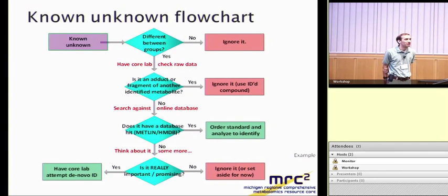There is work in the field attempting to collect the data all together into some sort of more cohesive strategy, to say all of these things fall under this umbrella, and here are all of the peaks that we have from that. Generally, the quantitation is very comparable across all of the things. You're not gaining much more information by having all of these little fragments.